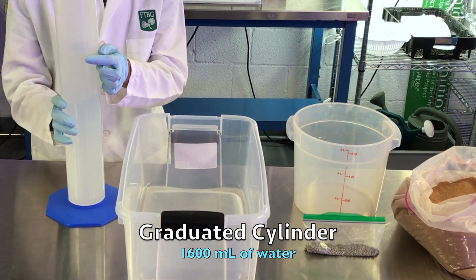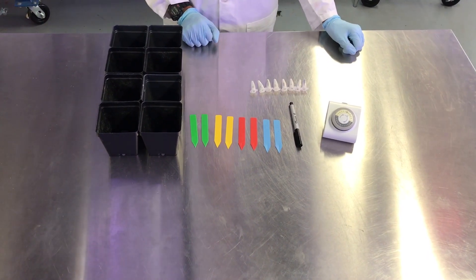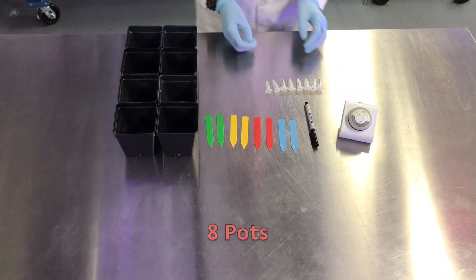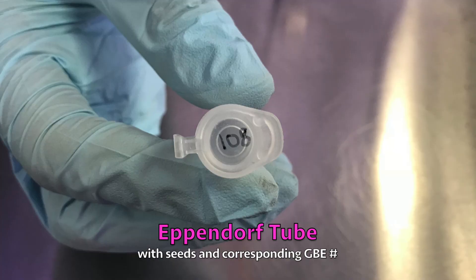You will also have these materials: eight pots to place the medium in, Eppendorf tubes with seeds and the corresponding GBE number.